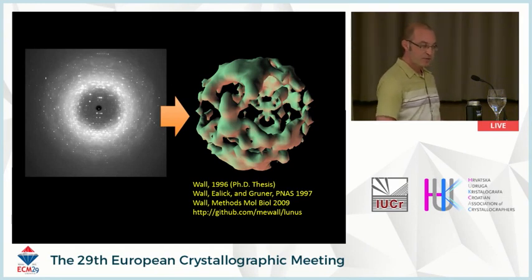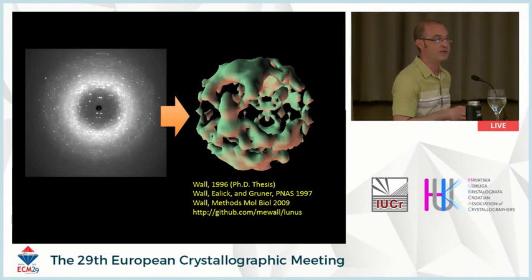So I became interested in this problem by working on diffuse scattering in staphylococcal nuclease. I developed some methods for integrating data sets that had strong enough diffuse signals to form a three-dimensional integration, very similar to the type of integration you do for your Bragg peaks.